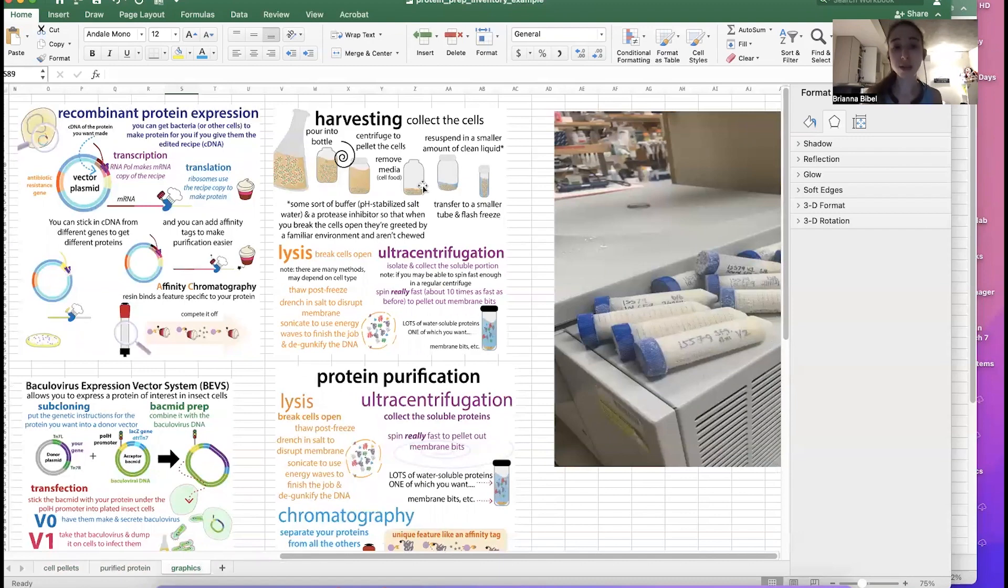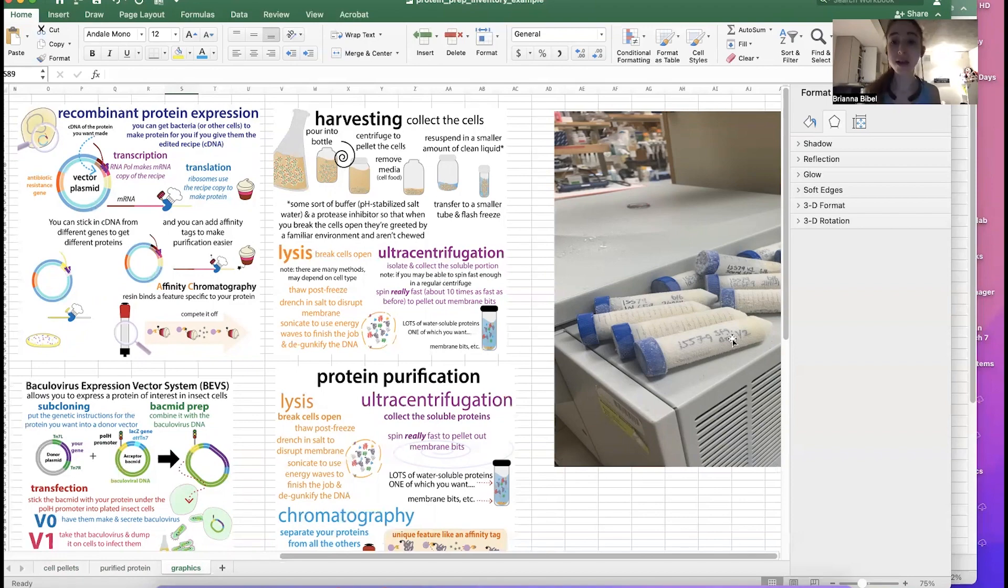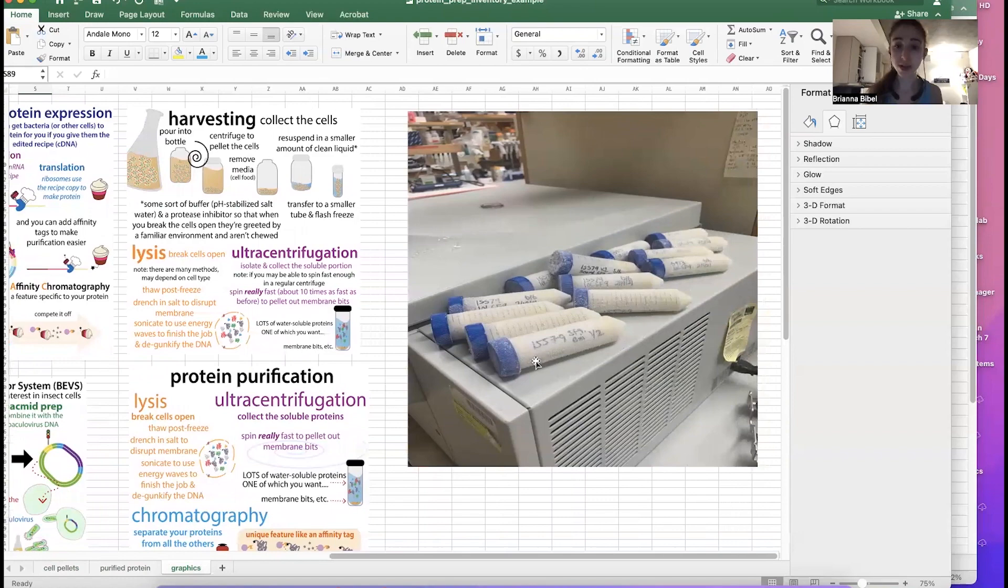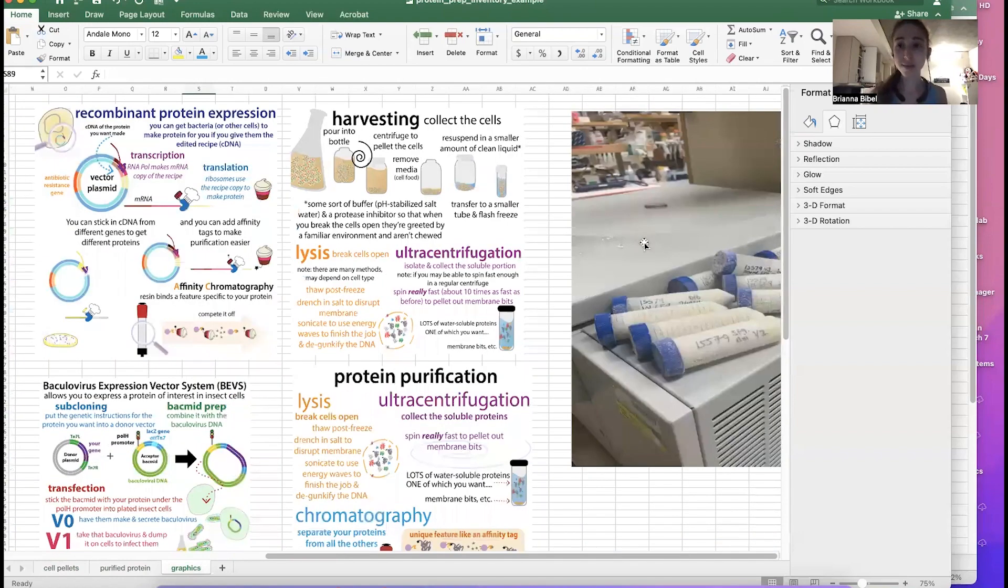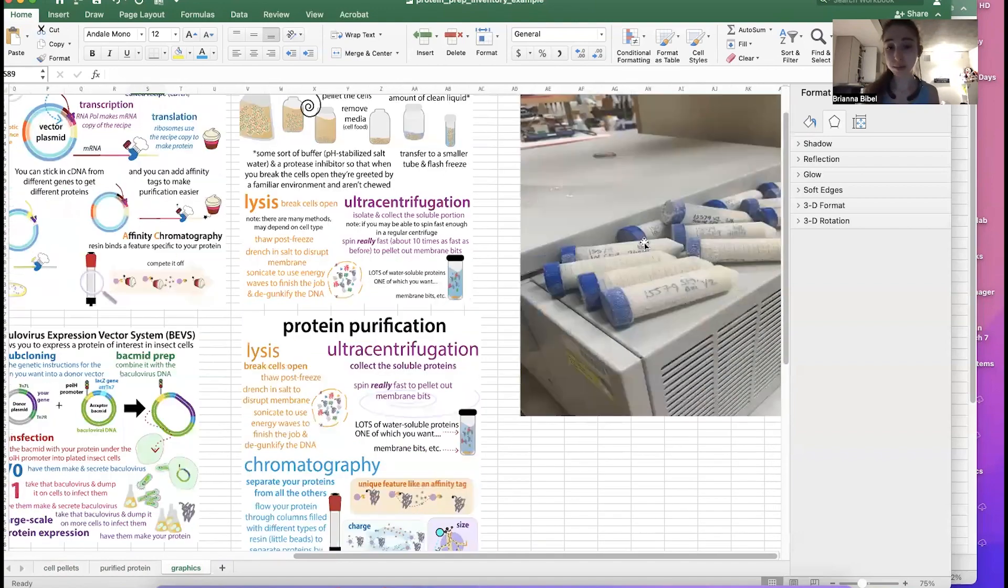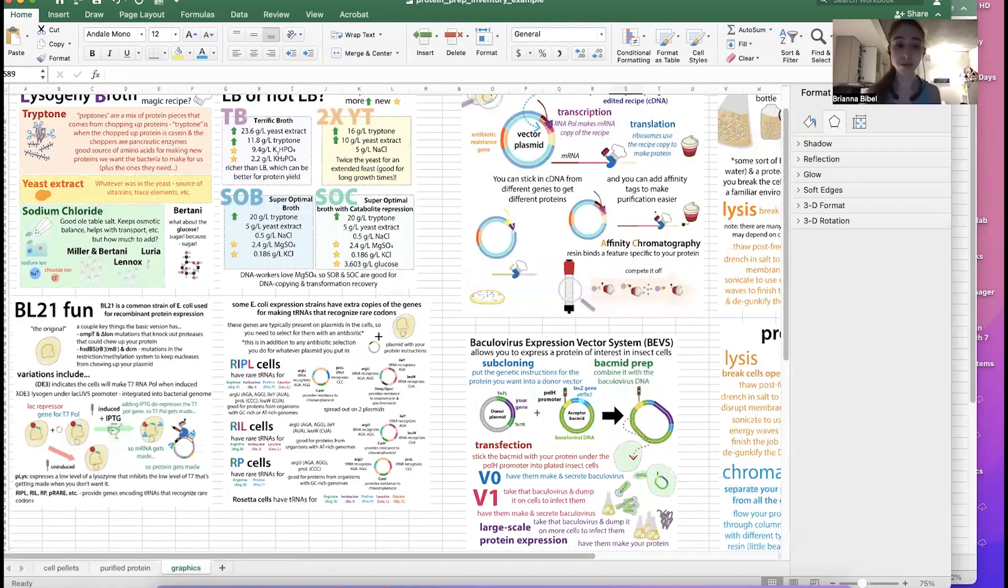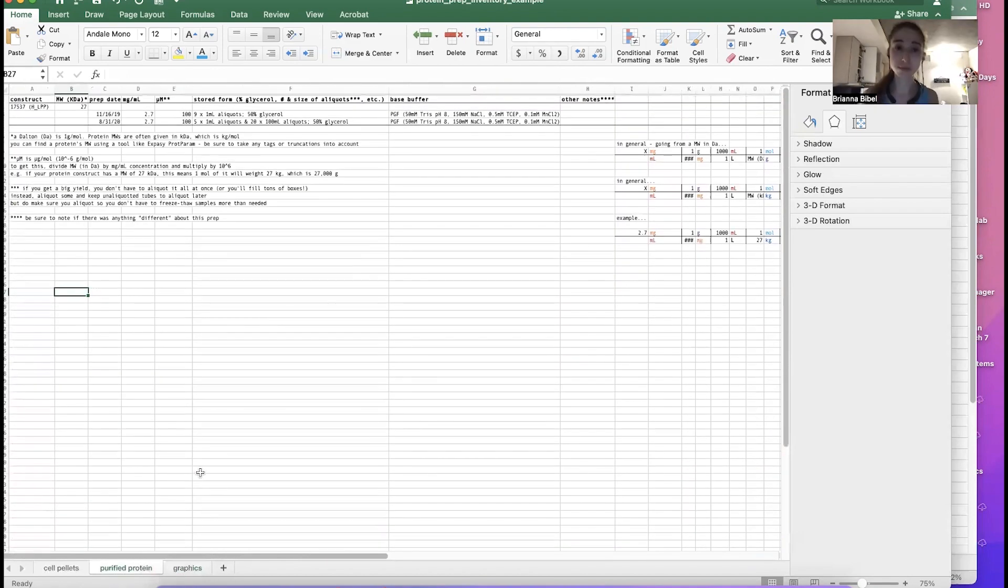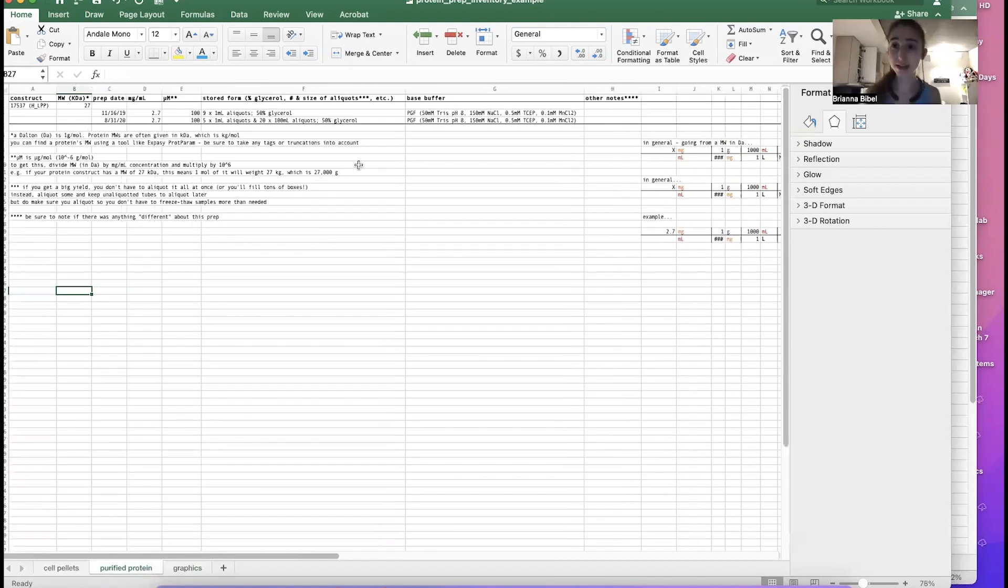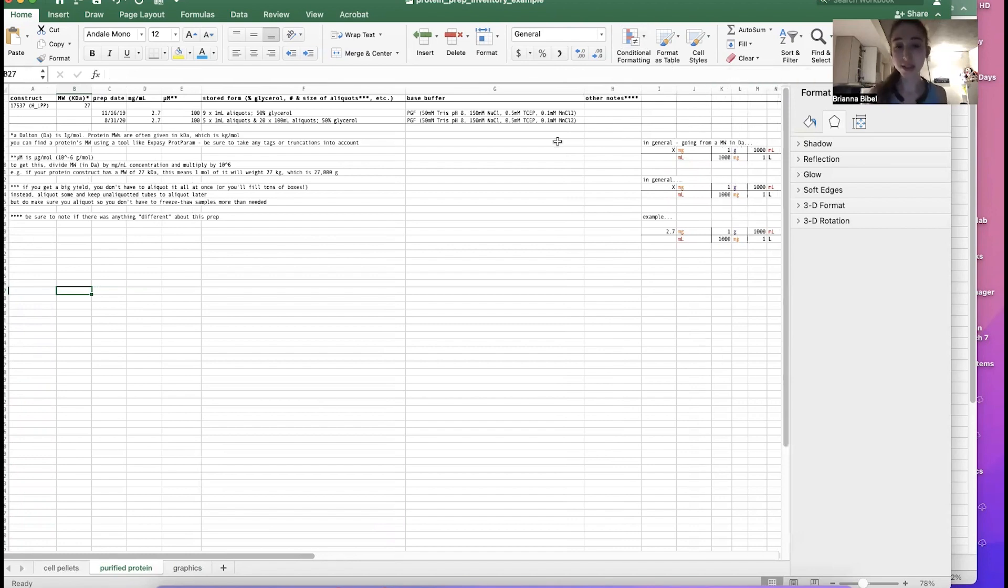Some people, they freeze it without resuspending it in a new buffer, and then they just resuspend it in a new buffer when they go to purify it. But so I end up with a bunch of tubes like this that have my protein inside of the cells. And then later, I will pop the cells open and purify out the protein using various forms of chromatography. And then once I get that purified protein, then I want to freeze it. So typically, I flash freeze it, add a little glycerol, cryoprotect it, so it doesn't freeze all funny.